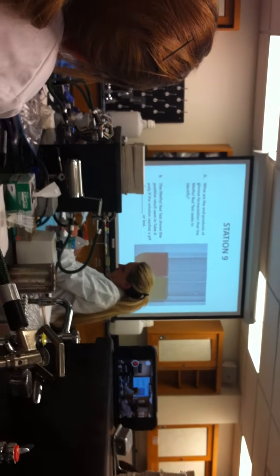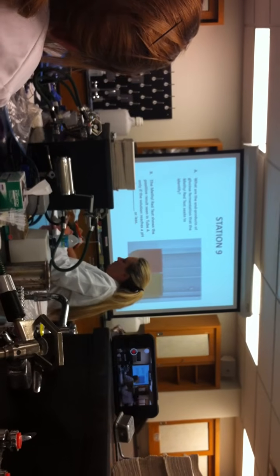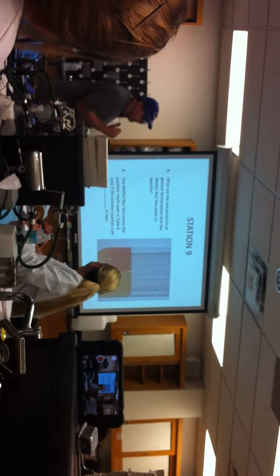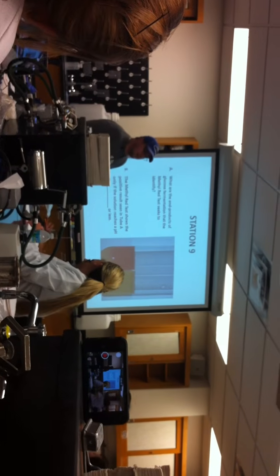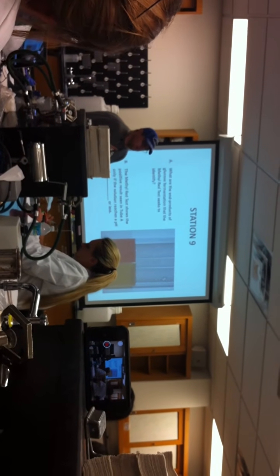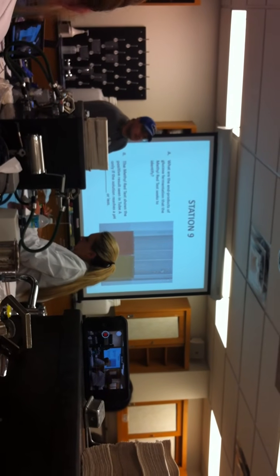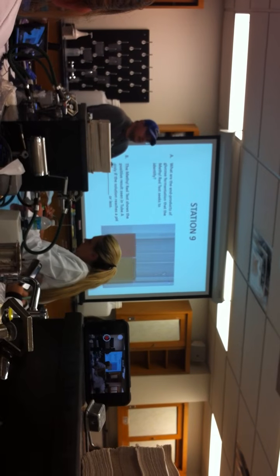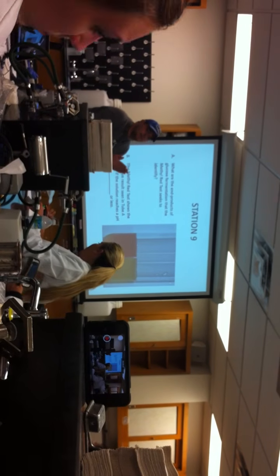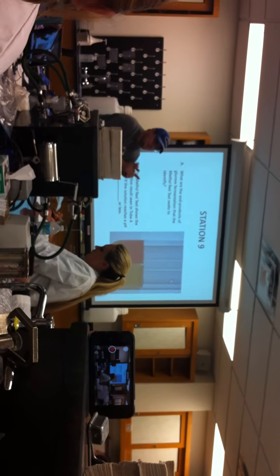Okay, methyl red test. We haven't done one of these, but we talked about it. Remember, there's methyl red and Voges-Proskauer. Y'all remember what Voges-Proskauer does? You need to know Voges-Proskauer. Okay? That's the rust colored. That is the rust-colored one, but the rust-colored one is looking for what kind of byproducts of fermentation? Acid. No.